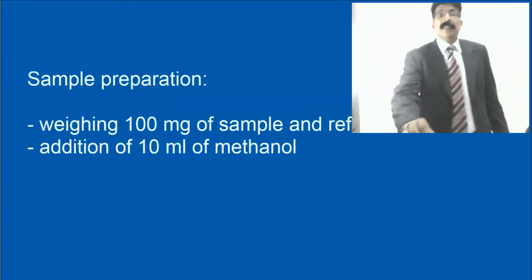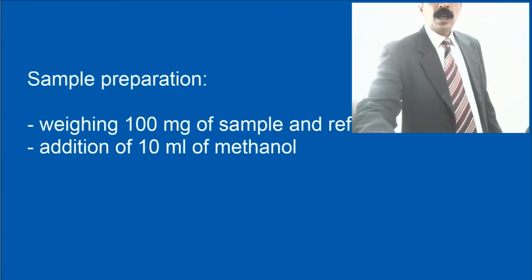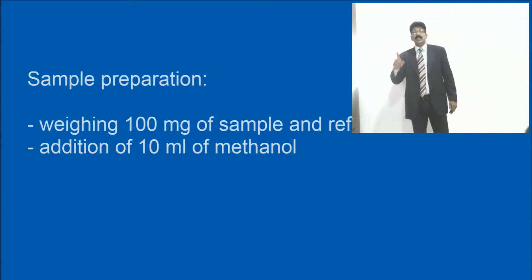Here you see you have to prepare a reference sample, and also you have to weigh 100 milligram of sample and reference, and add 10 ml of methanol.